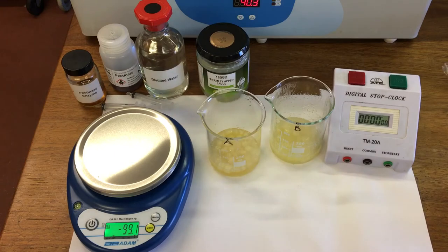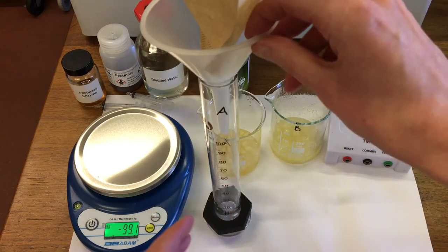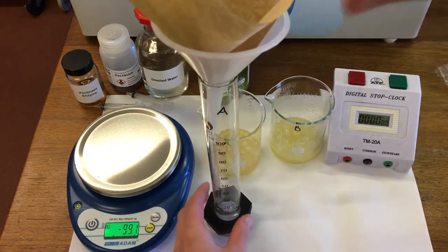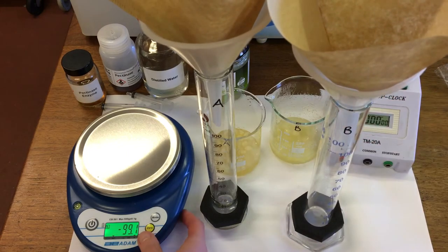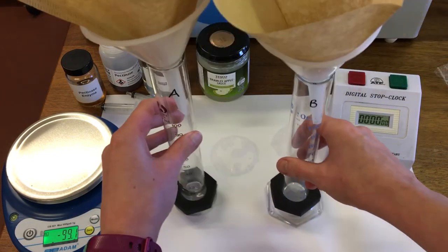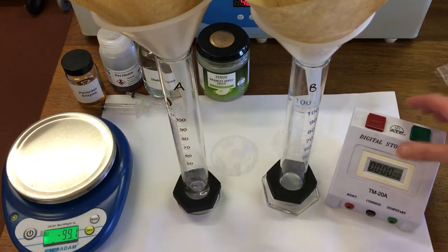We're then going to time how long they take to run through a filter. So I'm using a measuring cylinder, a filter funnel and a coffee filter paper. I'm going to start our timer and pour each through.